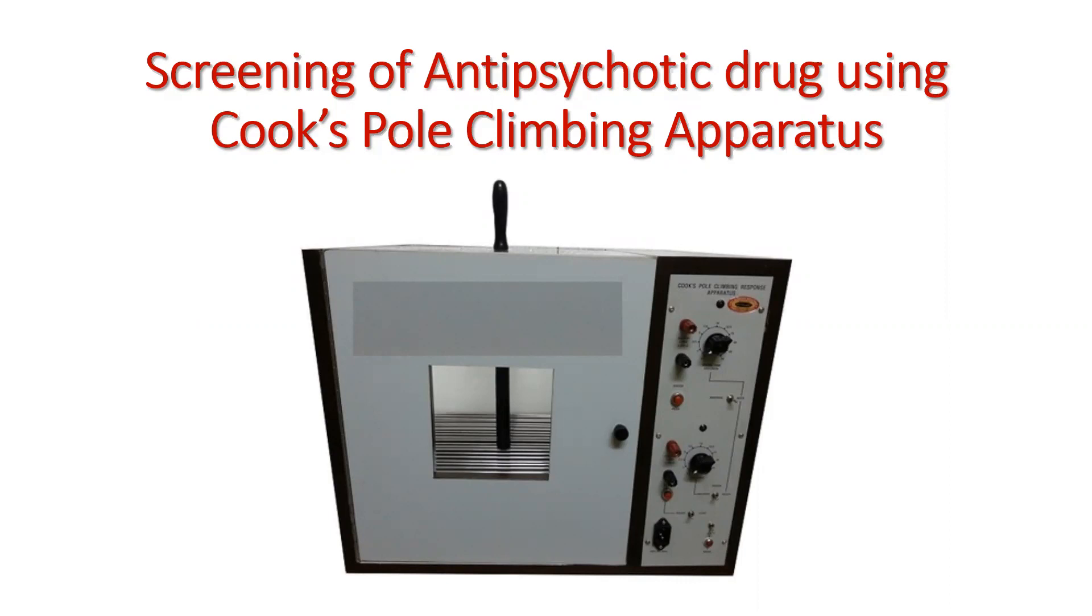Now this apparatus is also used for the screening of sedative hypnotic drugs and anxiolytic agents. The description of this instrument is already posted in one video, the link is provided here. Let's see how this screening is carried out using the pole climbing apparatus.